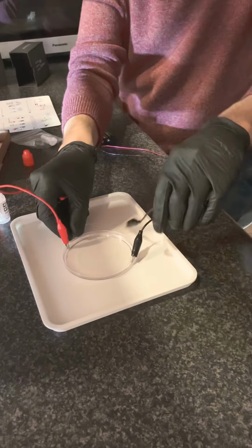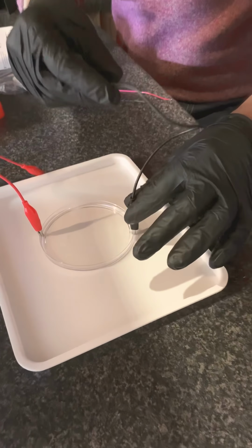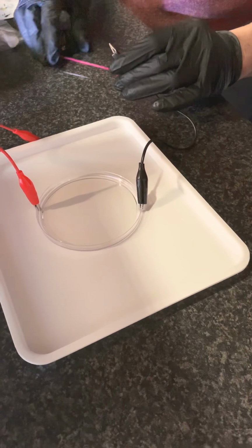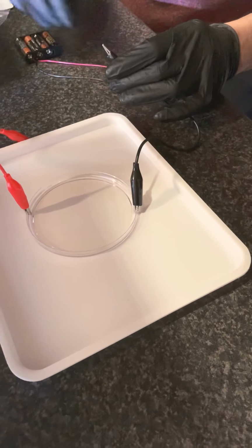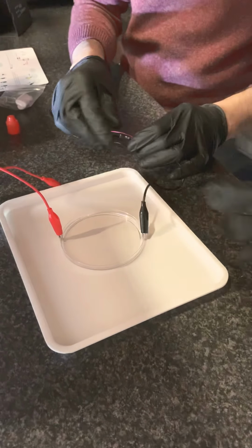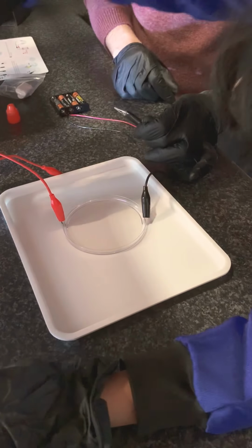Now you pin them on. And you have to make sure they don't touch each other, but that they touch the solution. Now you need to make sure they're touching the solution.